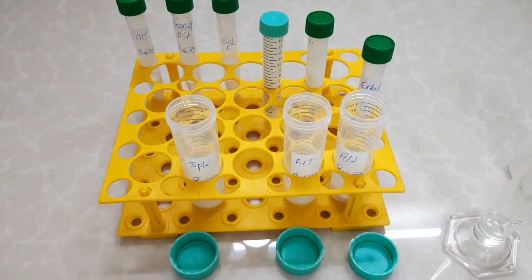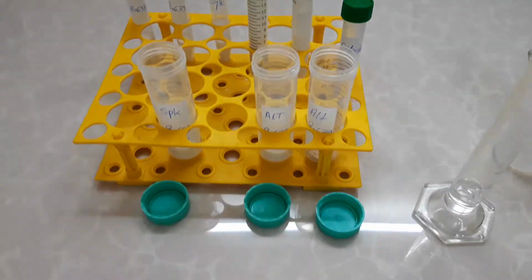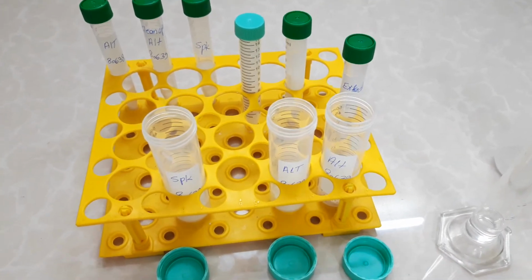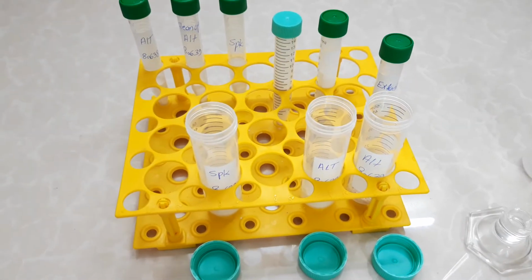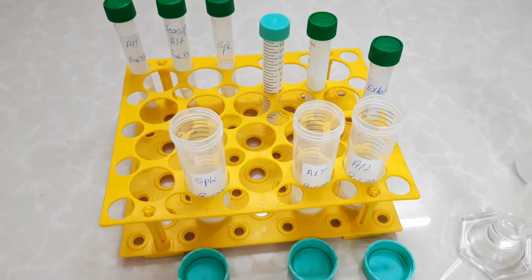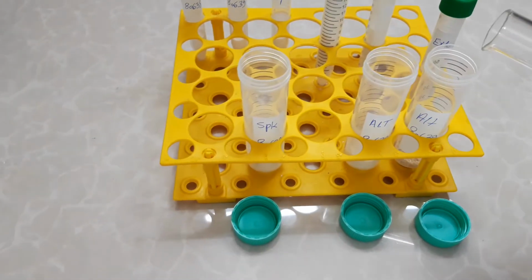Okay, after 5 minutes, deionized water should be added to dry samples like wheat, rice, and other cereals like beans. So we add 5 milliliters of water to the sample.